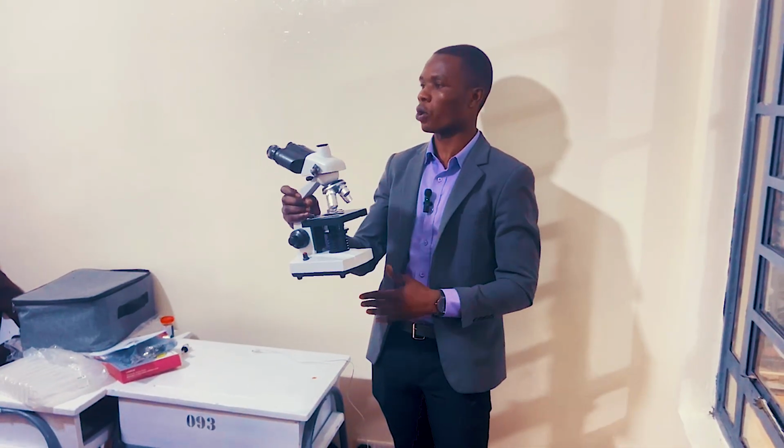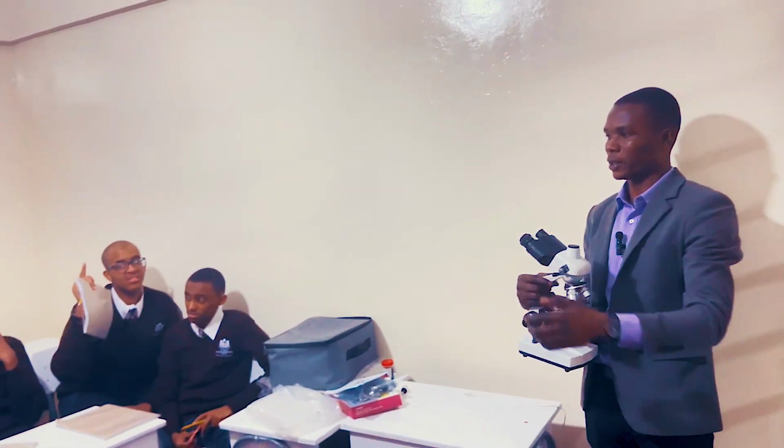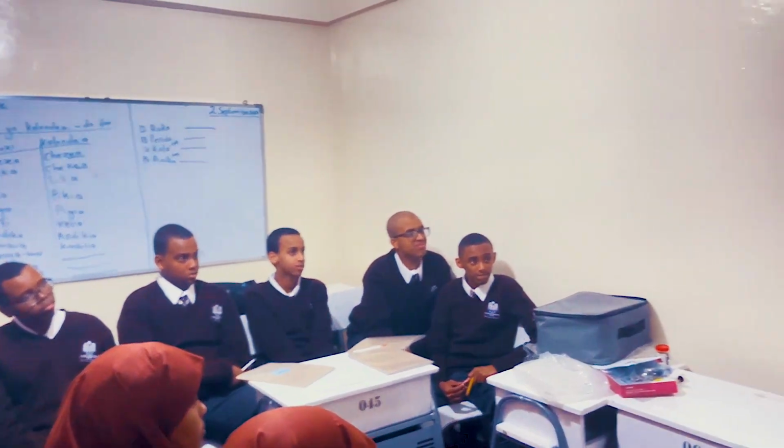So let's start with the part I'm holding. How do you call the part I'm holding? Two parts. Mohammed, how do you call these two parts? Yes, the eyepiece lens. So this is where you're going.